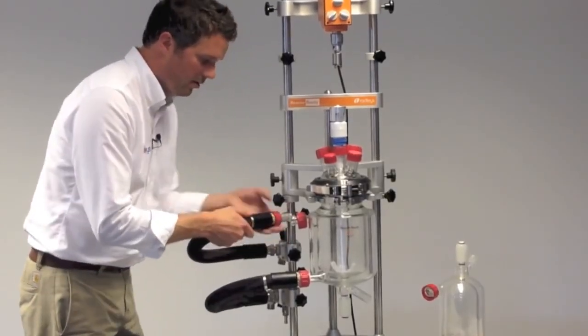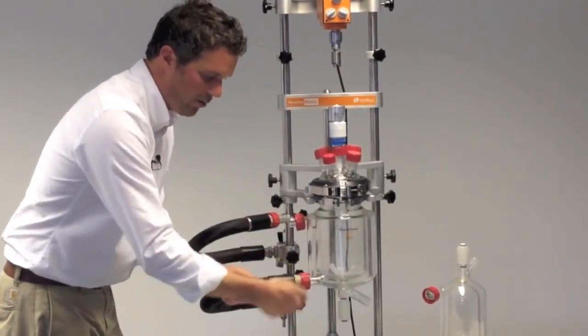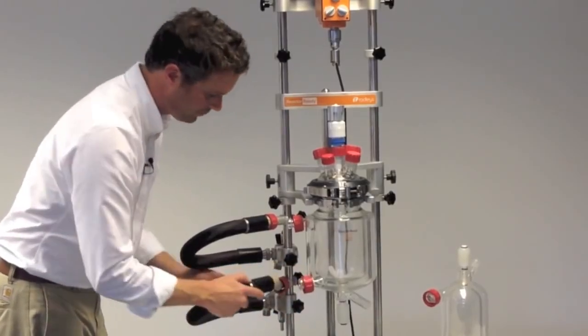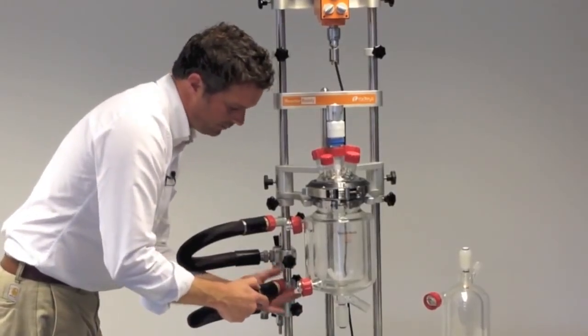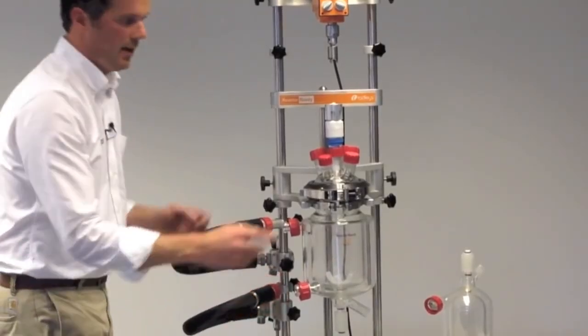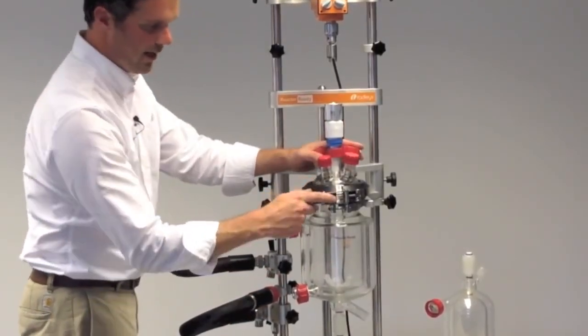I'll just pop this onto the hose tidy, just keeps hoses out of the way whilst you're changing vessels. Then we're free to take the lid off and undo the quick release clamp.